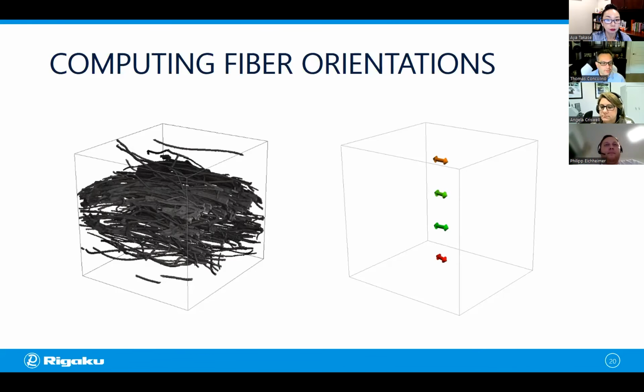Okay, and then the question that I had, and this is again for probably both of you. So when you did your first fiber find, obviously this was before we did anything with removing the binder and splitting them into the two segments, right? Came up with a 21 micron average and standard deviation of 5. Is that a data quality issue, or is it simply that the binder is making this massive contribution to this error essentially, right? Yeah, I think that's in our case.